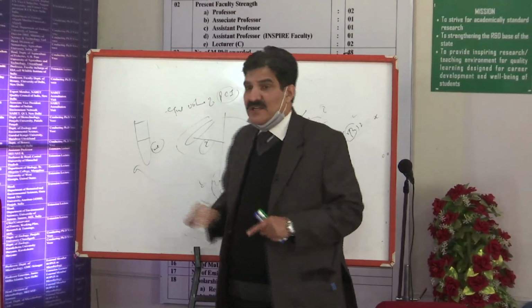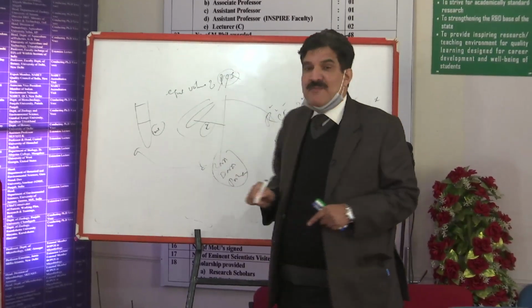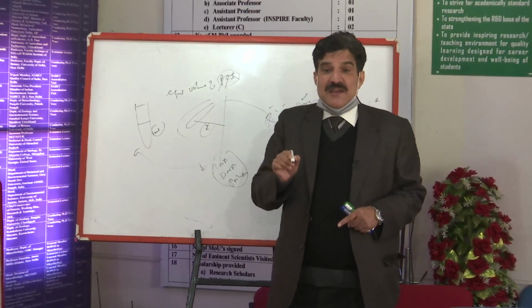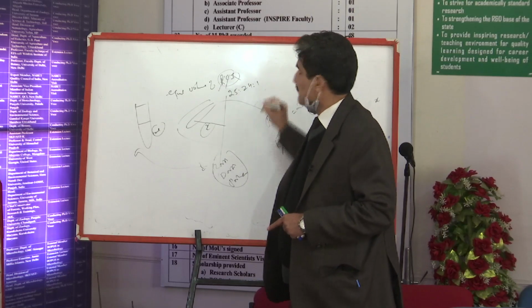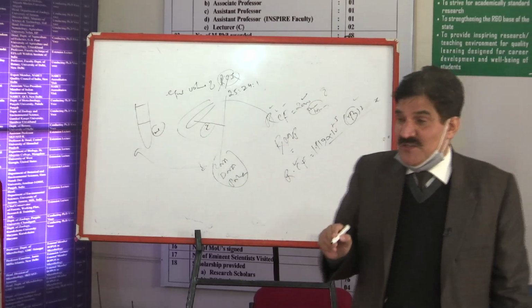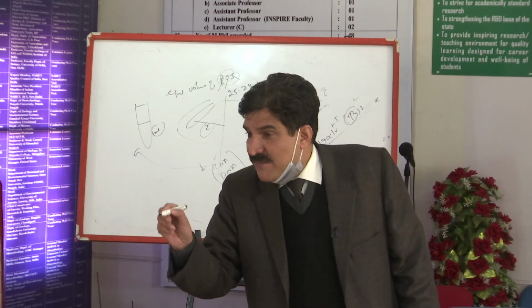Now to this 1 ml, you have to add an equal volume of PCI. What does it reflect? Phenol chloroform isoamyl alcohol, in the ratio of 25:24:1. A point very important, keep it in mind. It is a very important point. You have to add an equal volume of PCI. Not necessarily too much.